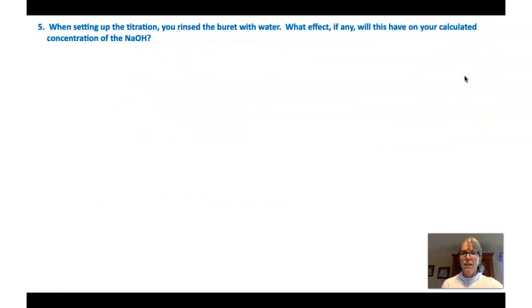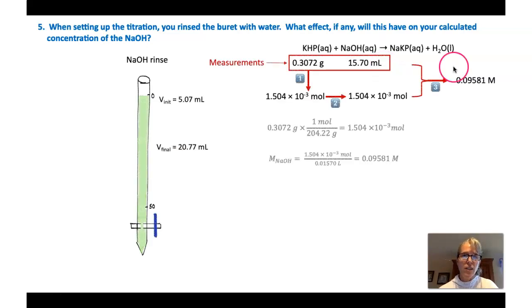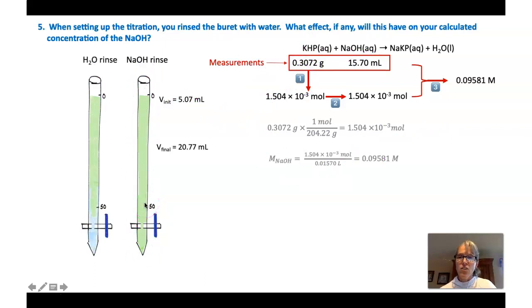Question 5. So when setting up the titration, you rinse the burette with water. What effect, if any, will this have on your calculated concentration of sodium hydroxide? All right, so let's take a look at the situation. Here's our equation, and here are the proper measurements and the proper calculations if we had rinsed it with sodium hydroxide. Now, as the question says, we didn't. We rinsed it with water.